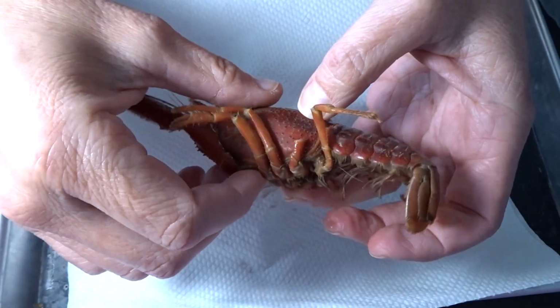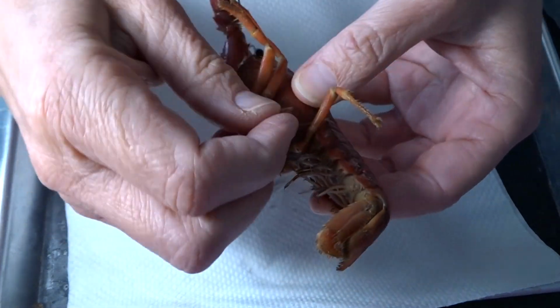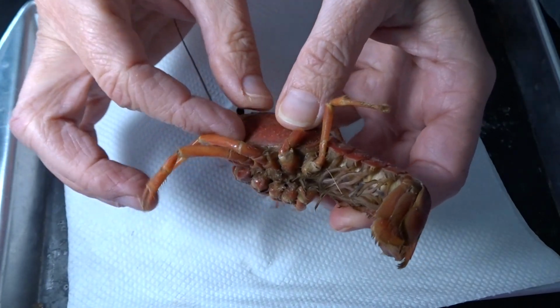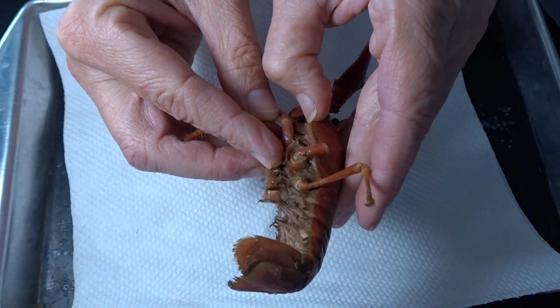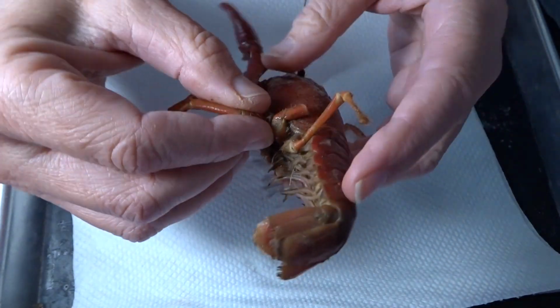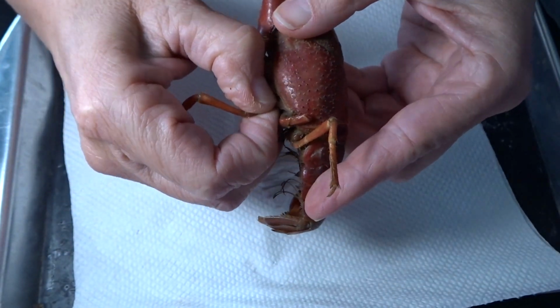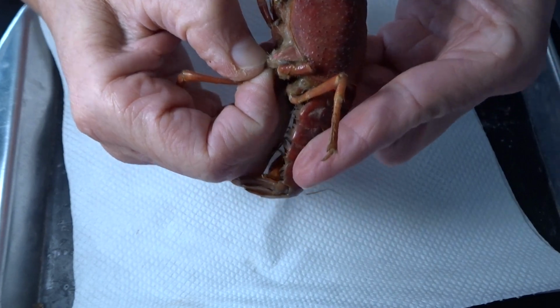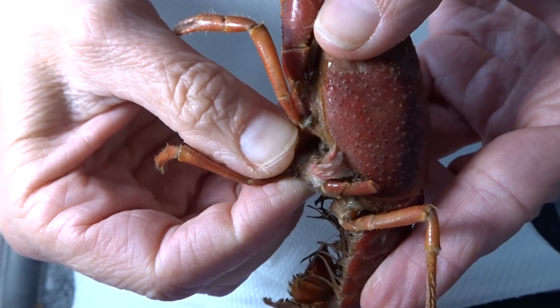What I would always have you do is you would go to one of these walking legs and you would try to pull, you wouldn't hold on. The carapace lifts up very easily, okay? I'm trying to show you, right? It lifts up very easily. But I want you to not squish on that and try to wiggle. I would have you wiggle a leg just at the base of that leg and wiggle and wiggle. And let me see, and try to pull something out of there.